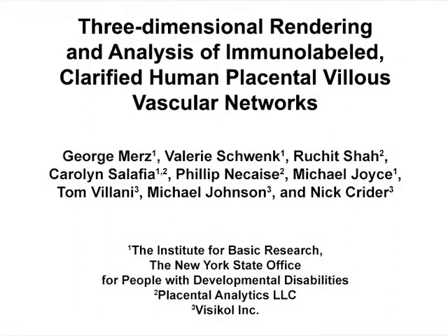The overall goal of this procedure is to generate 3D renderings of placenta villus tree fragments that are suitable for the analysis of their contained vascular networks. This method can help us answer key questions in our field, such as why a child may be growth restricted, or what stress and how severe the stress might have been that led to preterm birth.